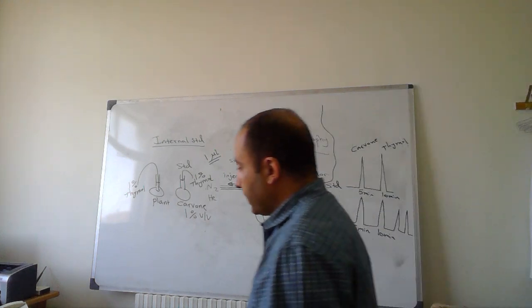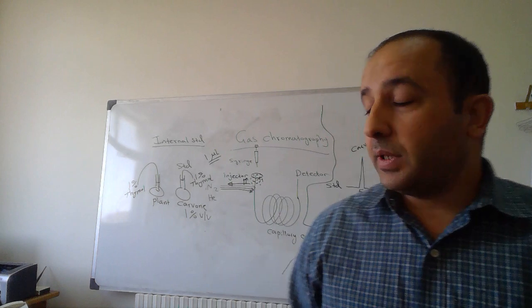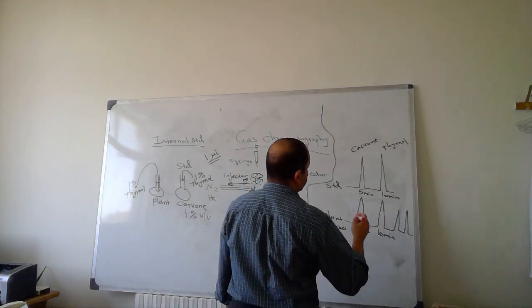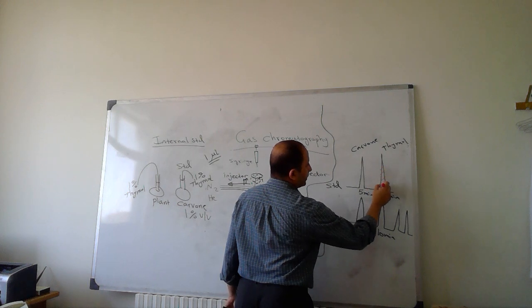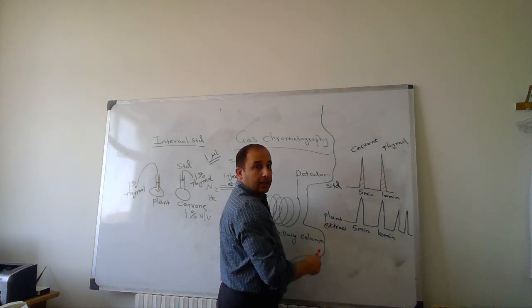Now, the computer of the instrument will give me the area under the curve for both the tested compound and the internal standard.